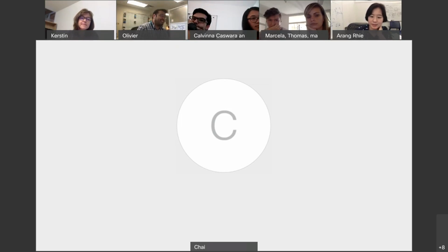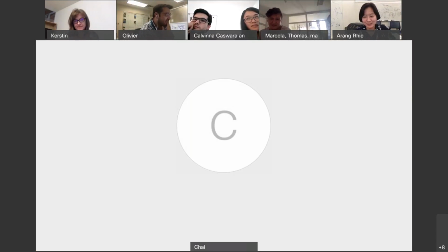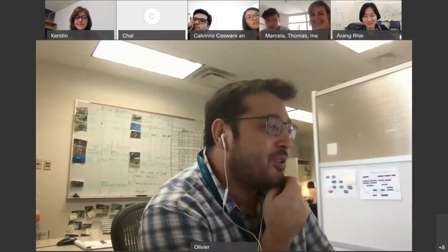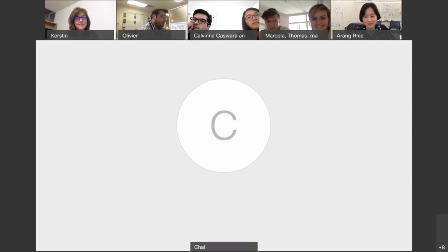Ping me. Okay, all right, sounds good. And basically, did you just run on this data set, or are you running BLAST on all the raw data? Yeah, we've done that, that's the process. And Julio was also assembling the mitochondria to double check. Okay, that sounds good. I'll put the applet in the project, so you can run that as well.